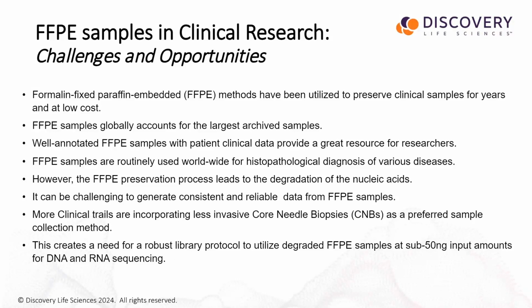What this creates is a need for a robust library prep protocol to not only utilize the degraded FFPE samples, but also handle sub-50 nanogram input amounts for both DNA and RNA sequencing on a consistent basis. These core-needle biopsy samples are not that big, and thus provide both challenges as well as opportunities for us to produce meaningful data from these highly precious FFPE samples from clinical trials.